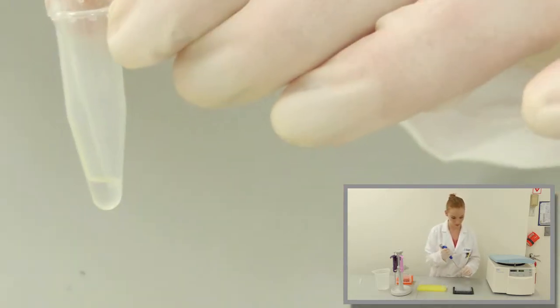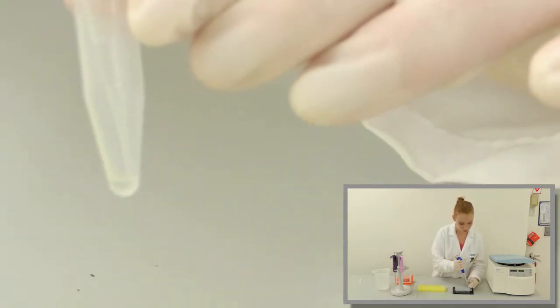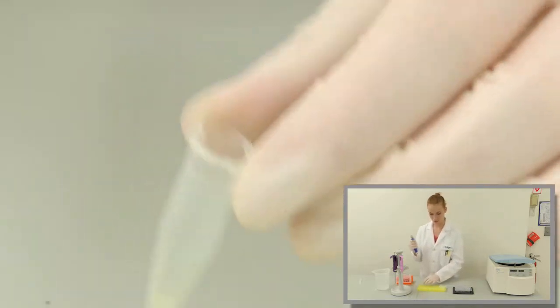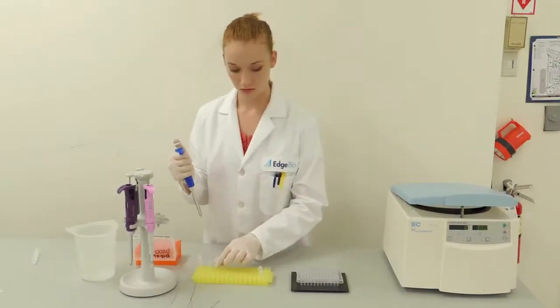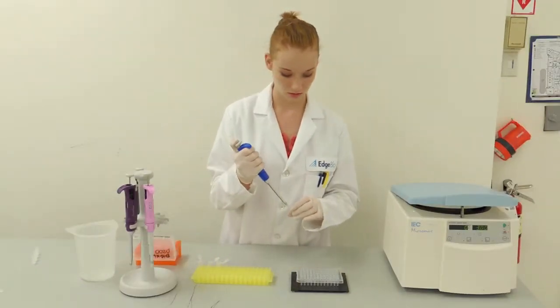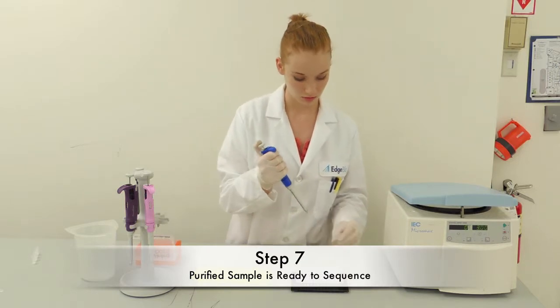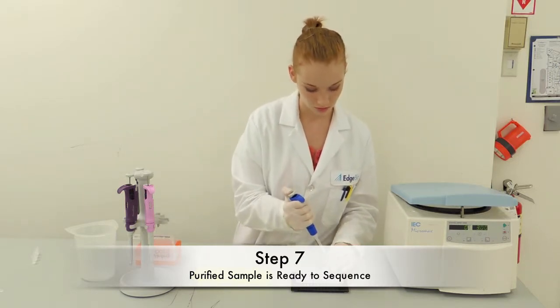The final step after basket removal would be to transfer the eluates from the micro centrifuge tubes over to a capillary plate of your choice. Once all of your samples are transferred, the plate can now be sent off for sequencing.